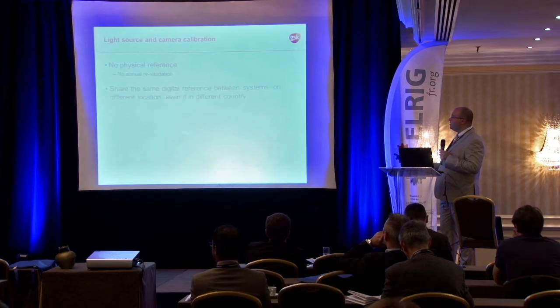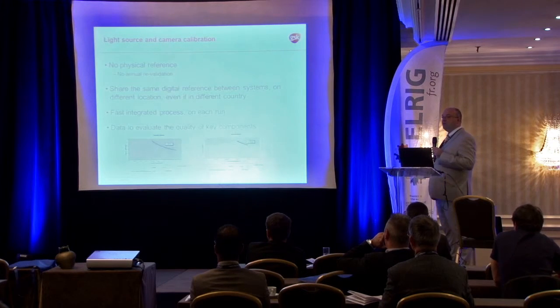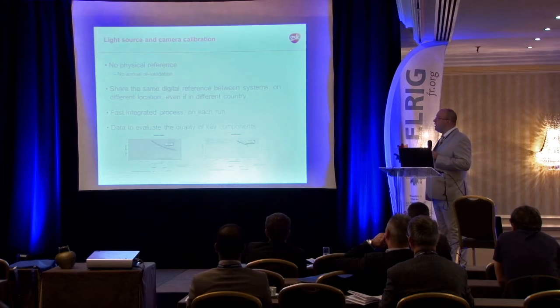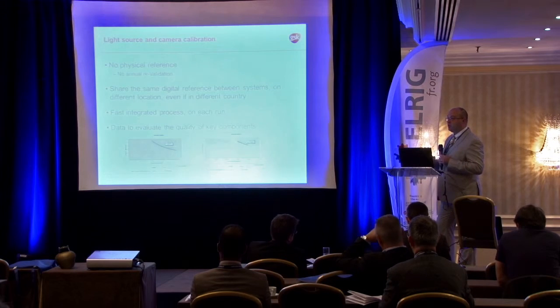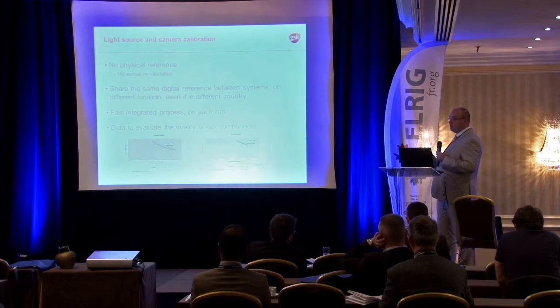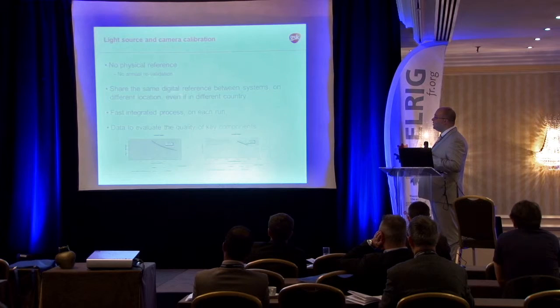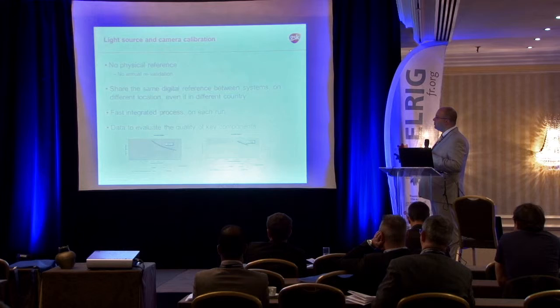So really the benefit of this type of calibration is no physical reference. You don't need to revalidate your reference each year. Most of the time, that's something very difficult to manage because you need to have two references, because when the first one is going back for revalidation, you need also to continue your job in the lab. So you need two references, so it means that you have two supports to validate and so on. That's a lot of paperwork and side work to manage. So no physical reference, that's very important.